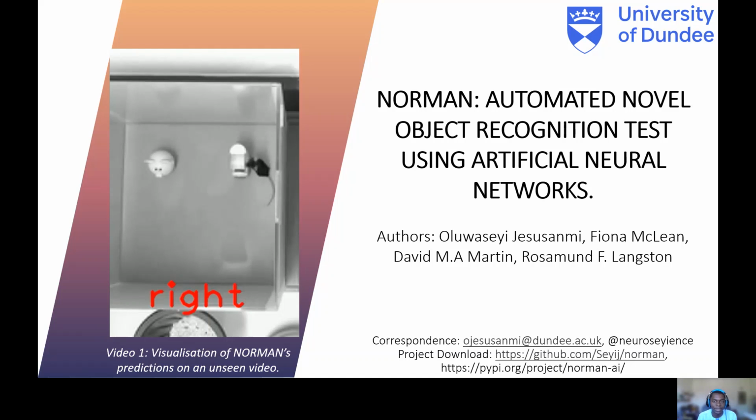Hello, I'm Oluwaseyi Jesusanmi, and I'd like to introduce you to Norman, the Novel Object Recognition Mice Analysis Network. This is an AI system that automates the novel object recognition test.